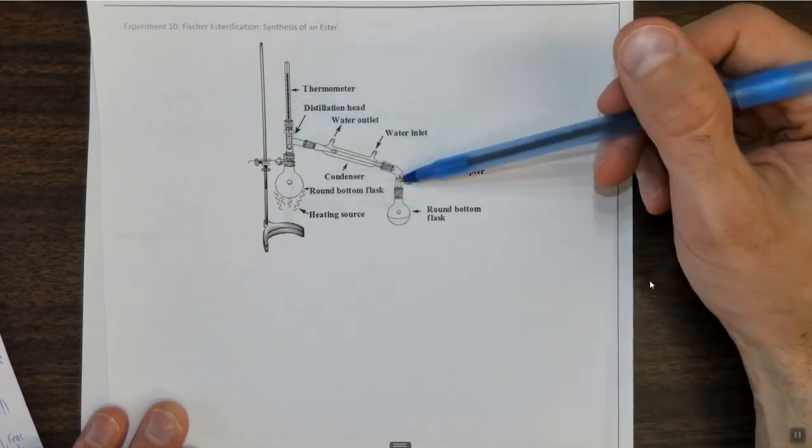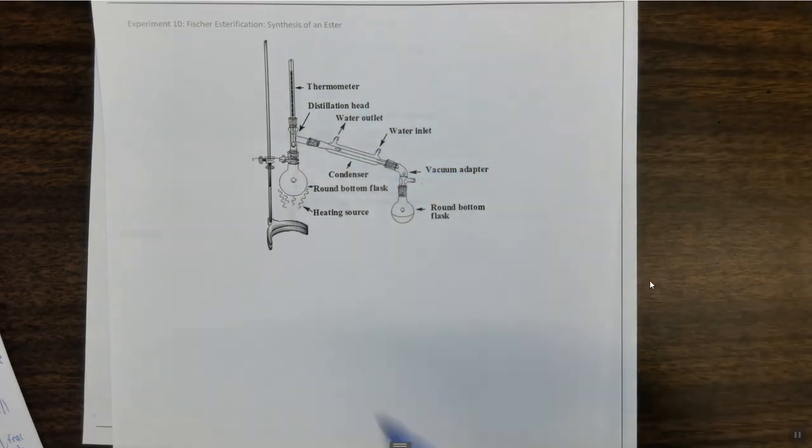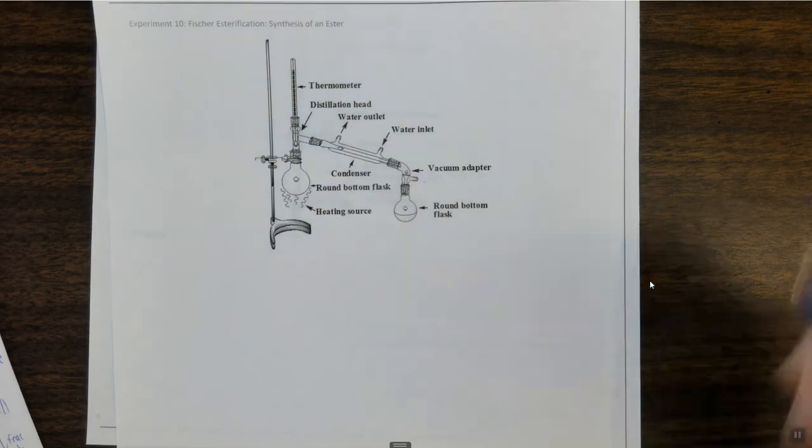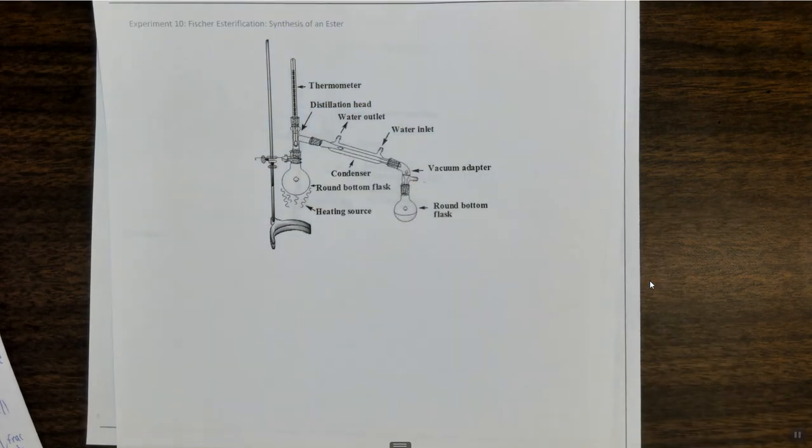Then we should put on this fraction 2, and we should collect most, but not all, of our isopropyl acetate. We don't want to boil to dryness. So in this case, we should then have a boiling point of isopropyl acetate.